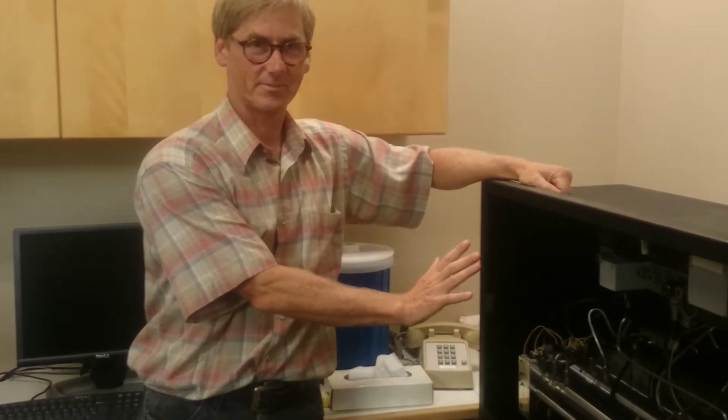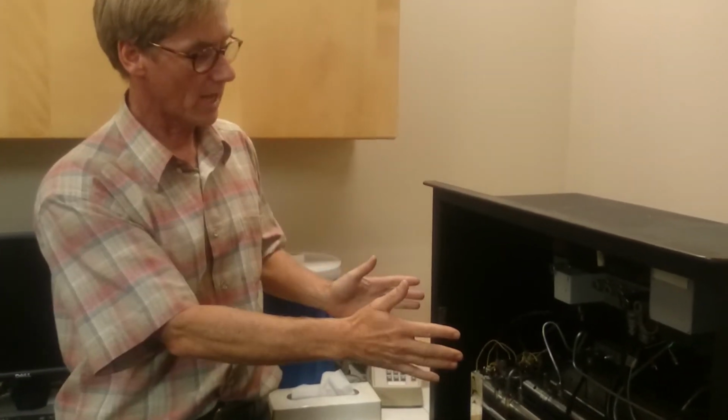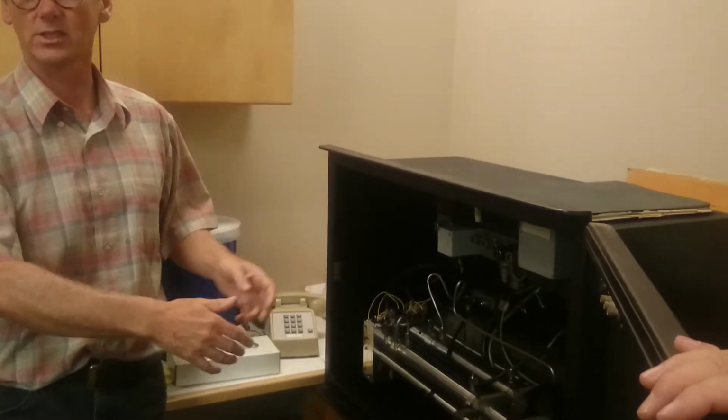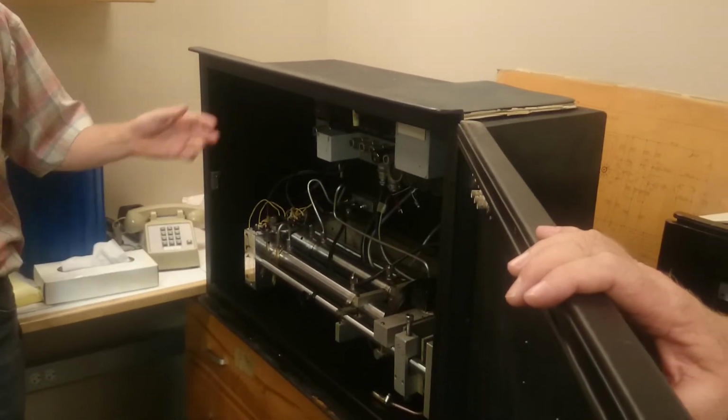He didn't build this. I should say that this technology was developed by the Germans around World War II, and I think it was launched for the need to measure air on U-boats. But it's also been used in mines, so this had a lot of commercial use. This was being rolled out as a commercial gas analyzing technology in the 1950s.